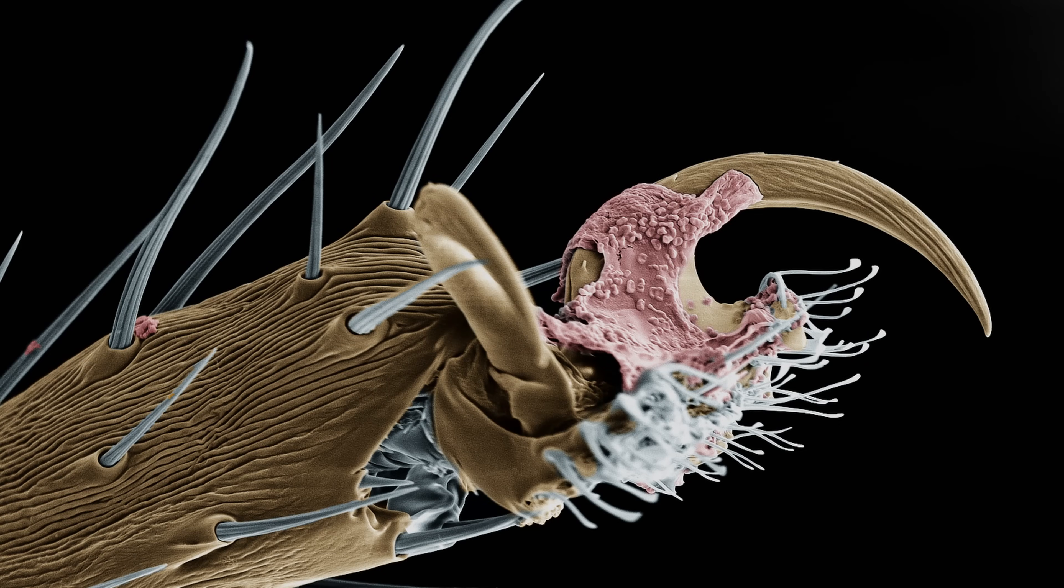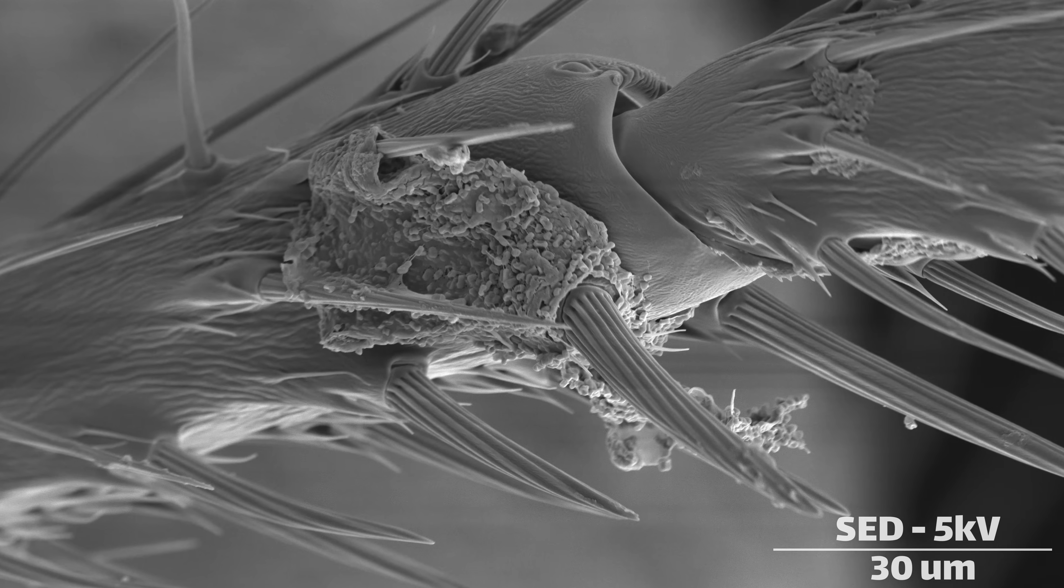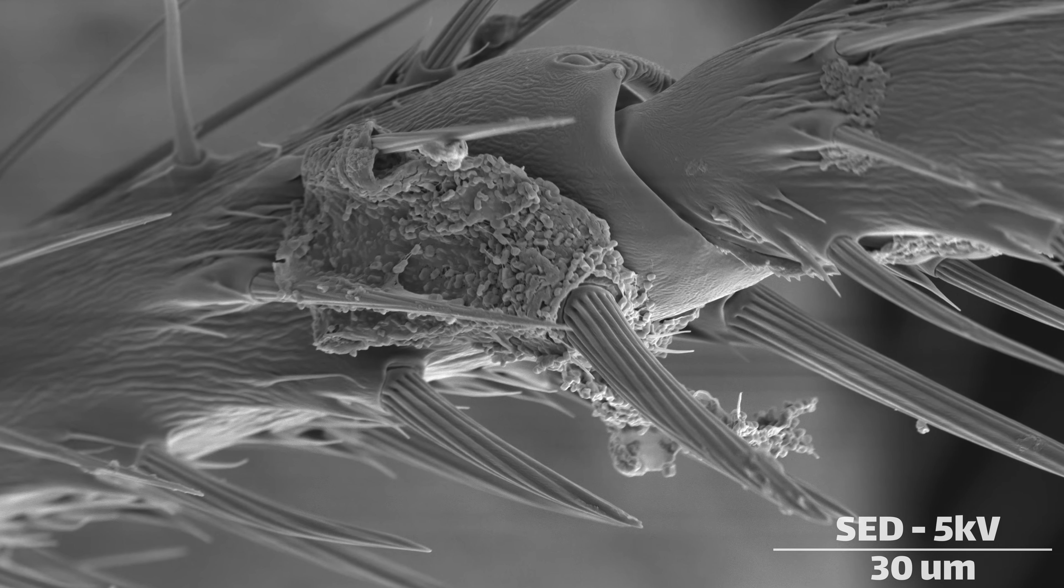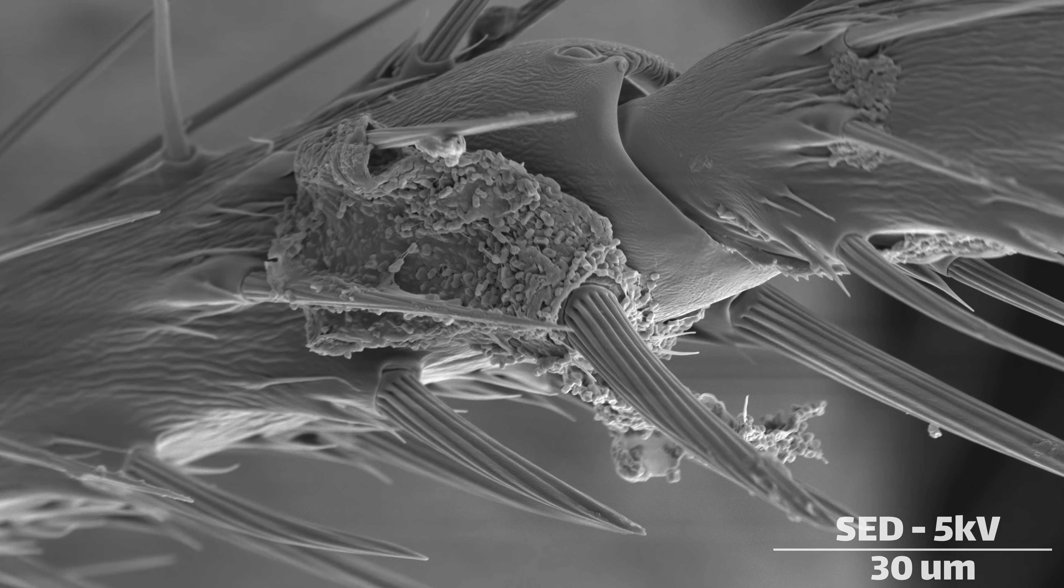What I love about these micrographs is that the closer you look, the more questions arise. Did you notice those small spheres and blobs attached to the claws earlier? While it's difficult to know exactly what these are, they're most likely yeast cells, or in some cases plant pollen.